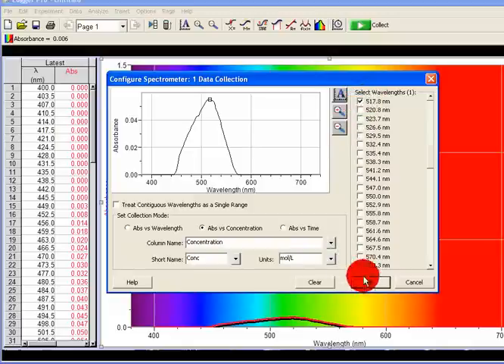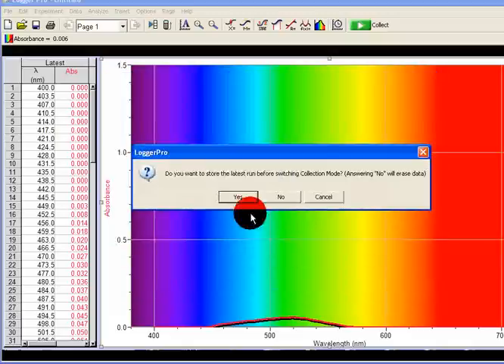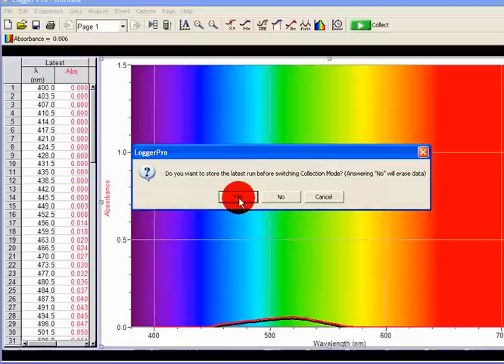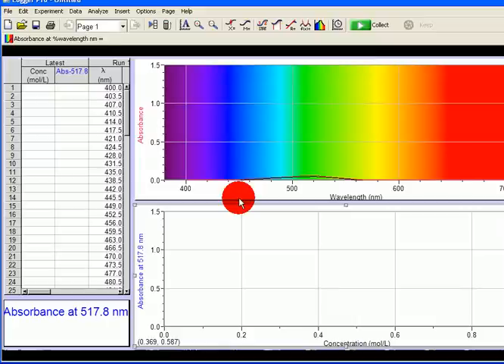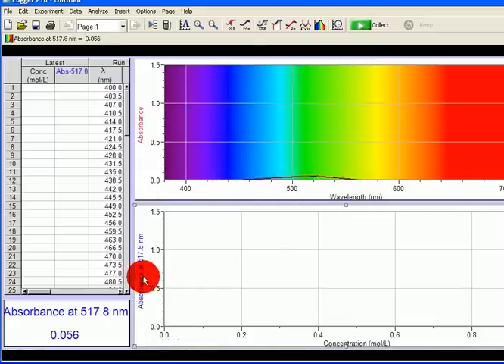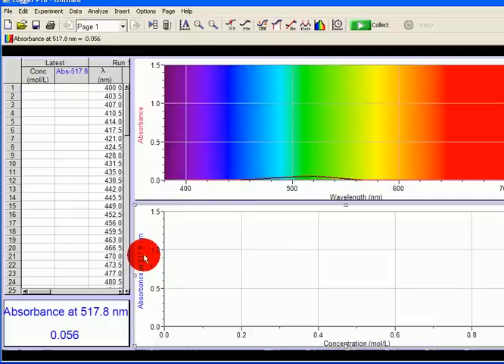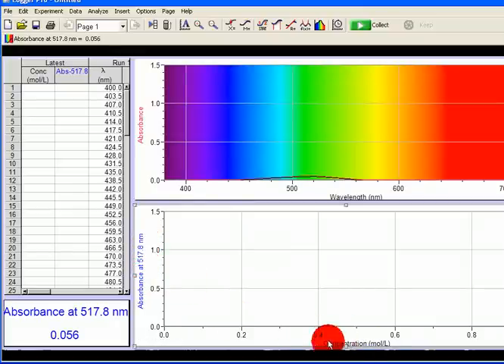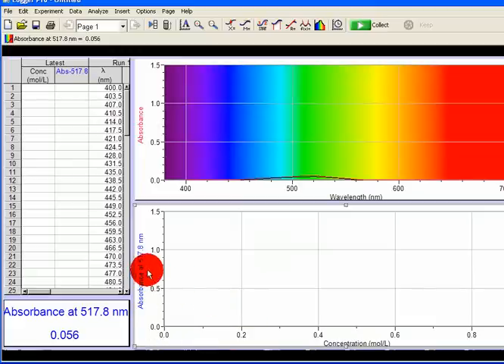Click on OK. I will always want to store the latest run, so I click on Yes. So what I have now is my absorbance, and now I will have absorbance at the selected lambda max of 517 nanometers. I've prepared different concentrations and I'm going to measure their absorbance, and hopefully I get a standard calibration curve for cobalt chloride which is red in color.